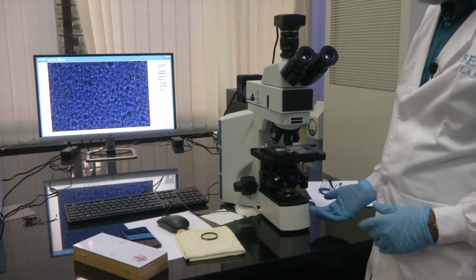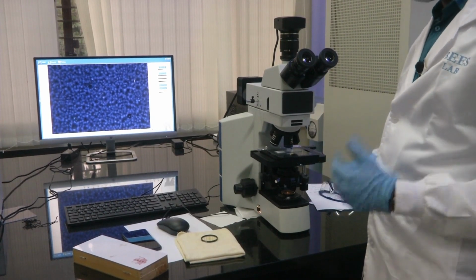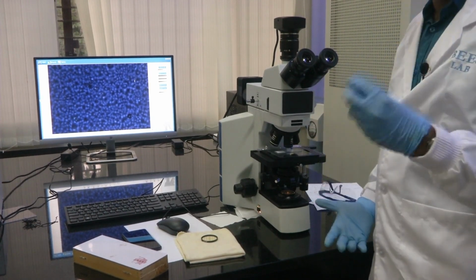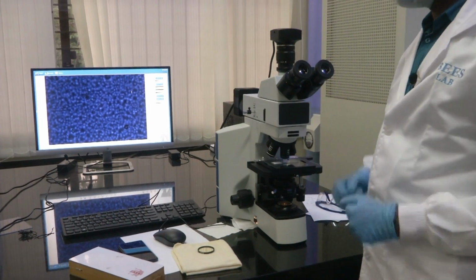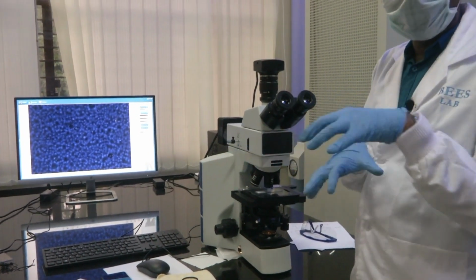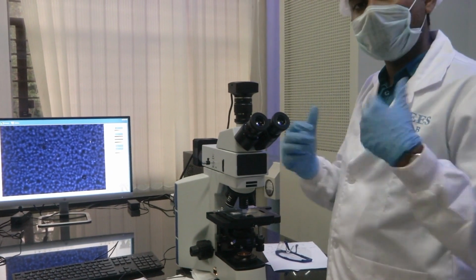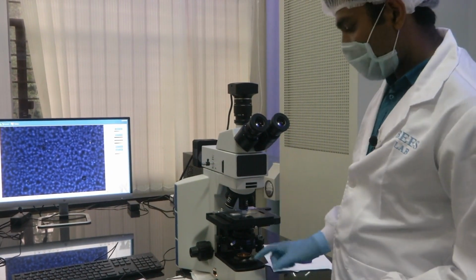This is another light source, another method by which we can do fluorescence microscopy, which I discussed before. What happens in this is, you excite your sample with a particular light. Your sample will respond to only a particular wavelength. Let us say you excite your sample with blue light only, then parts of the sample which respond to that blue light will start emitting another light back. That way you can do fluorescence microscopy. Now I have put the blue light filter.